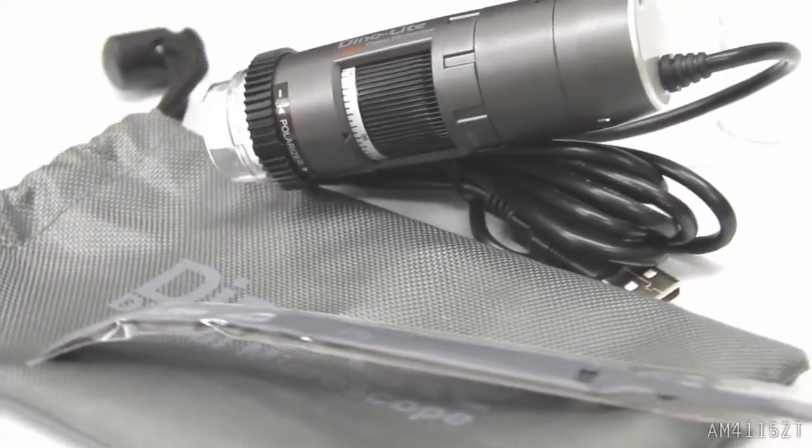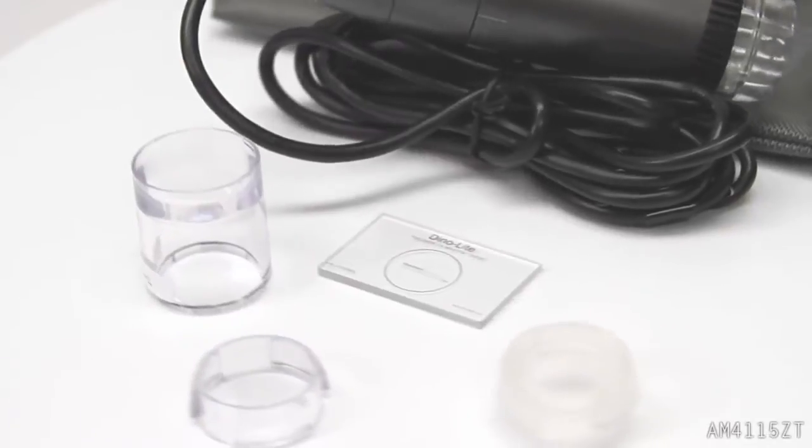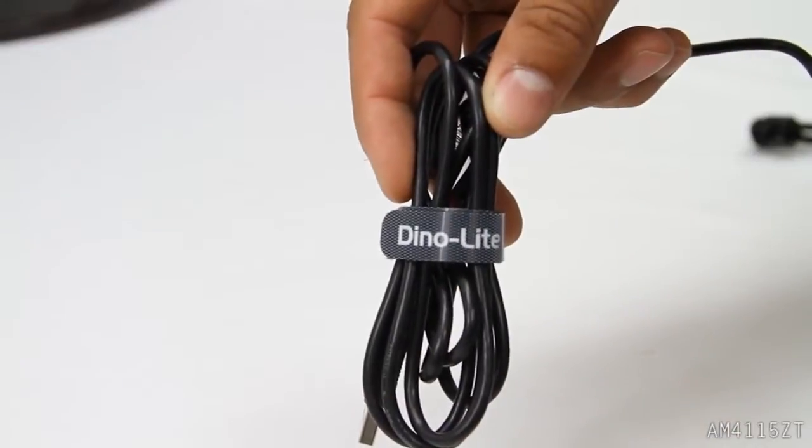The AM4115ZT includes a carry pouch, cable velcro, interchangeable caps, and measurement calibration slide.